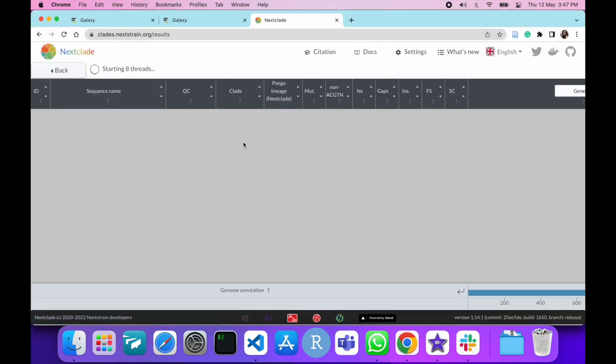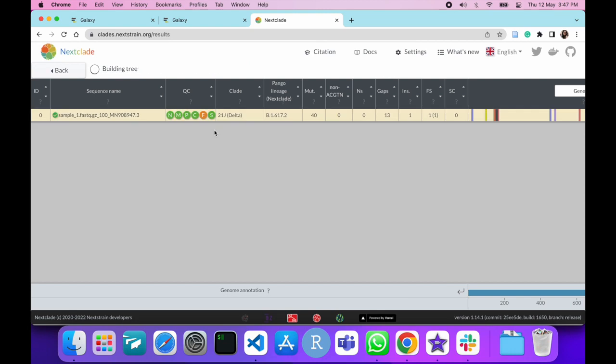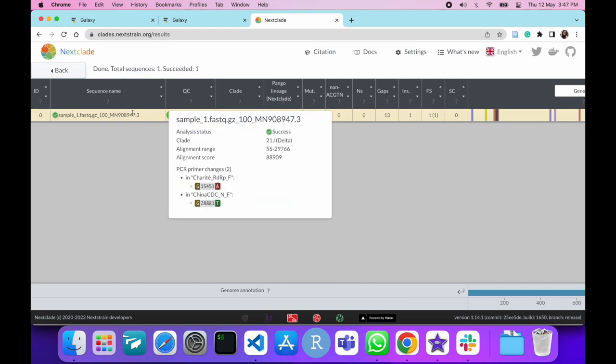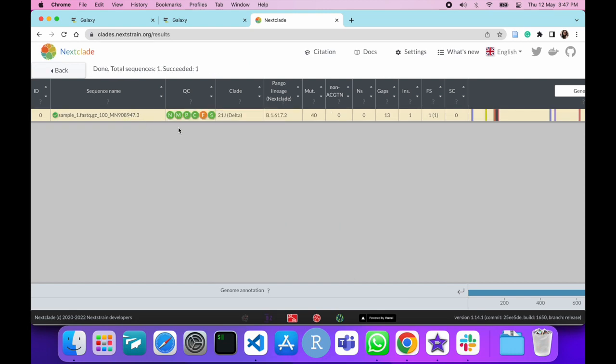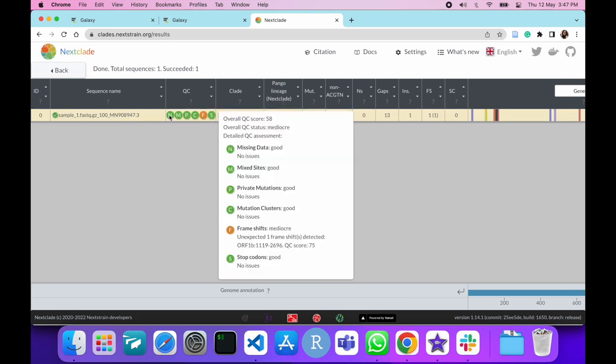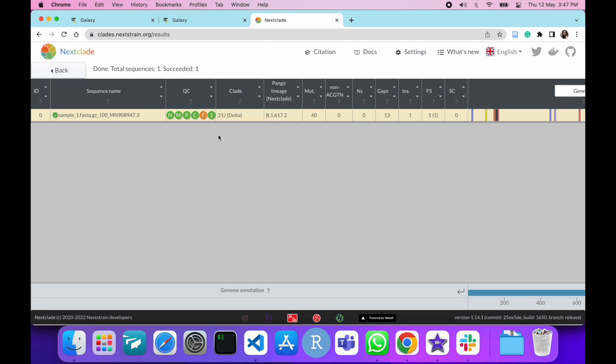Now you can see the Nextclade output. The output displays different QC metrics, clade to which your sample belongs to, and the pangolin lineage.